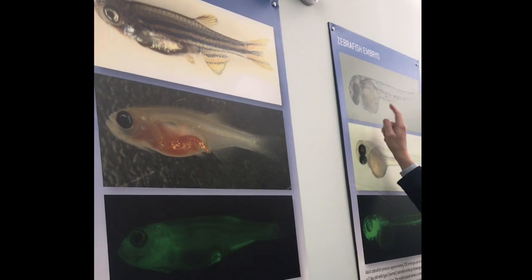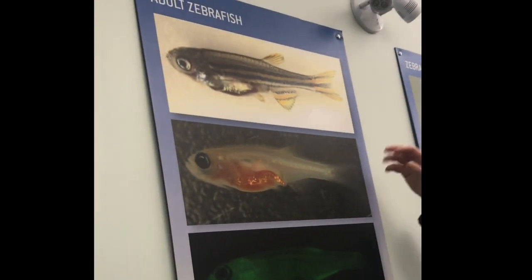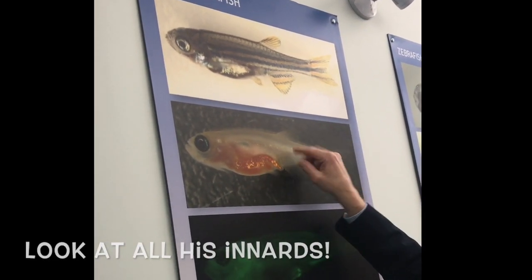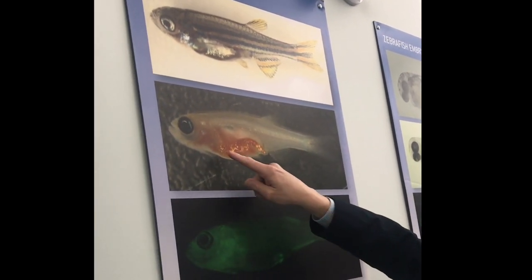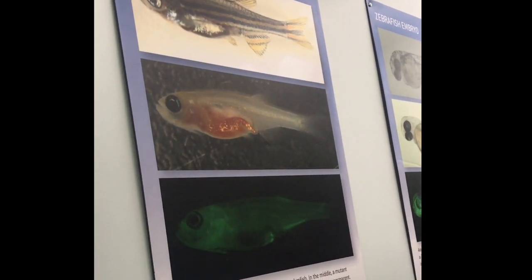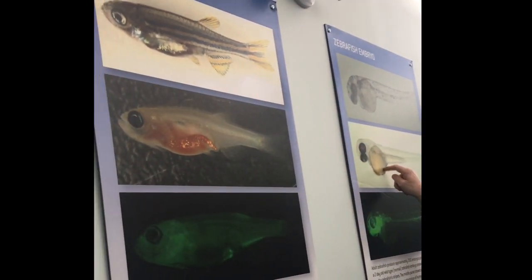Nutrition for the first few days of life. It's sort of like the placenta for the zebrafish. We have a number of different mutant zebrafish that we use. So these mutants are called Casper mutants. They're fish that have no stripes. They're completely transparent. People say you can read the newspaper through these fish. You can see their hearts pumping, and you can see the females' eggs, and you can see food moving through their GI tract. And we use these for our transplant studies because they're completely transparent.